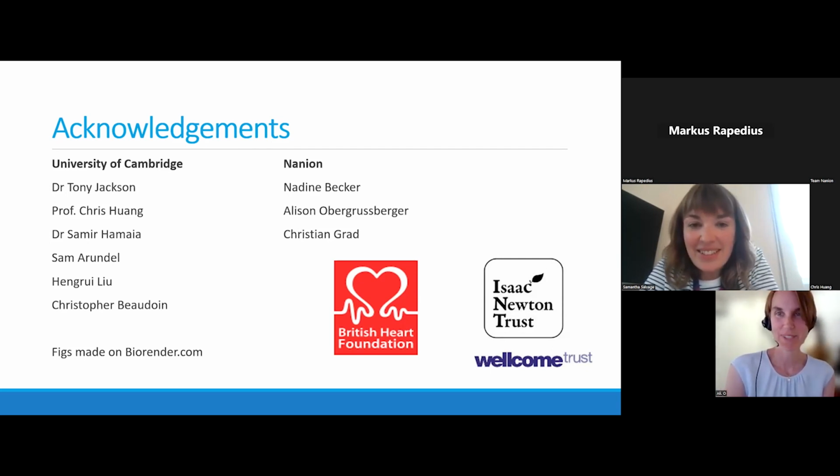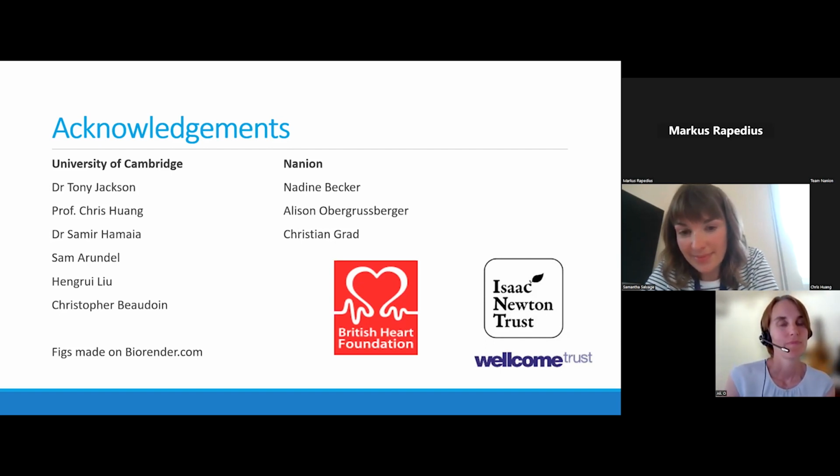I see Marcus has his hand raised, so please unmute yourself, Marcus. Hi, everybody. Really nice talk. Thanks for sharing the data. I have a question along with the D3 S3-S4 single-chain antibody. Is this region intracellular, or is the target extracellular? It's extracellular. It's one of the extracellular loops.